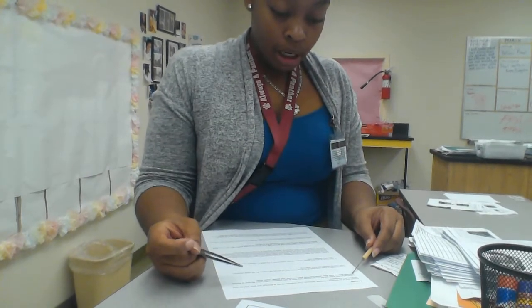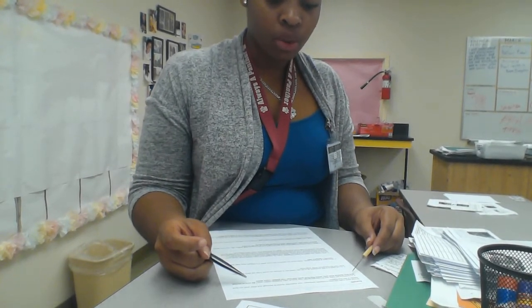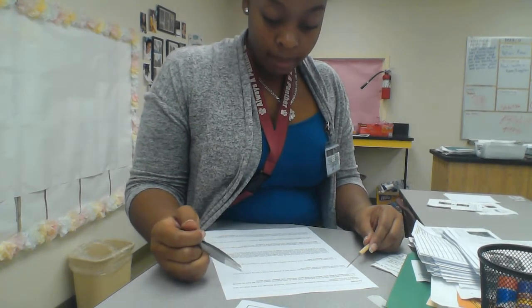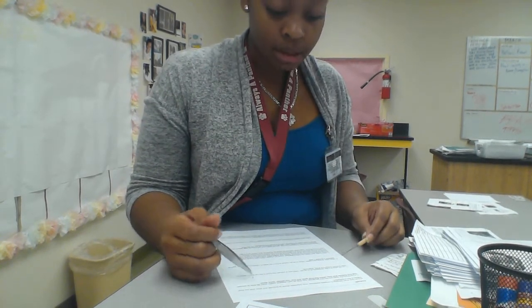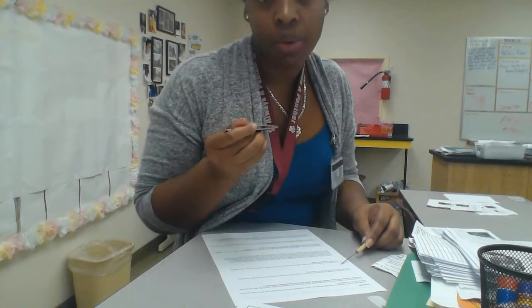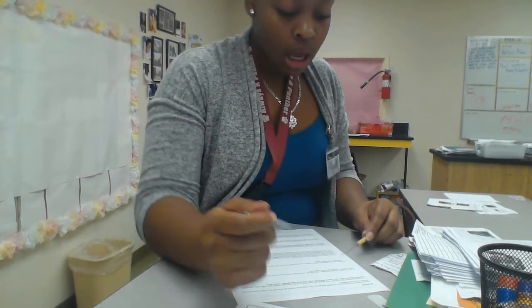Thank you. But so the intro video that you guys are going to watch talks about how the owl actually digests its prey and things like that. And also on this worksheet, it talks about that. So make sure you answer number 1, and be sure to answer every single part. I'm talking about like it captures it, then it does what with it. From that part to the part that it regurgitates this pellet, I want to know.